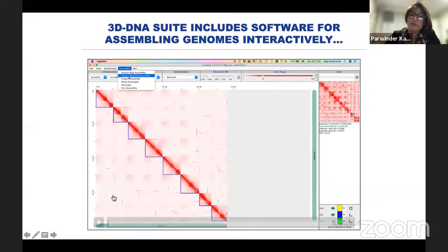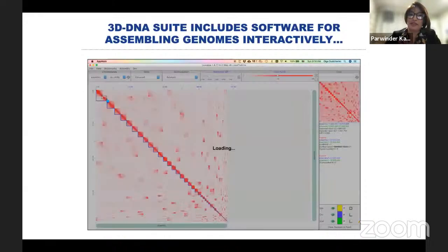This is a genome which I spent 7 years of my career trying to put together as a chromosome length assembly, probably spent $500,000 to do. It's a half a gig genome, which nowadays we can do for less than $500. And these are really nice 8 chromosomes. It only took 10 minutes using this software developed by Dr. Olga Dudchenko in Baylor College of Medicine lab. Once we were able to take a photograph of that DNA, which was troubling me for 7 years, that was the beginning of all this exciting work, which I have been able to achieve in the last few years of my life.